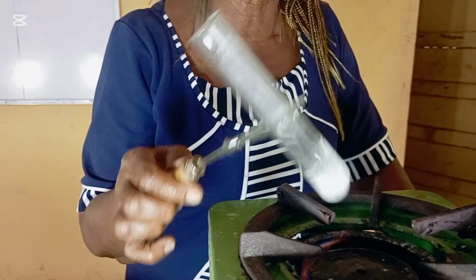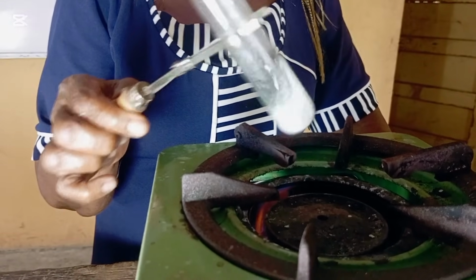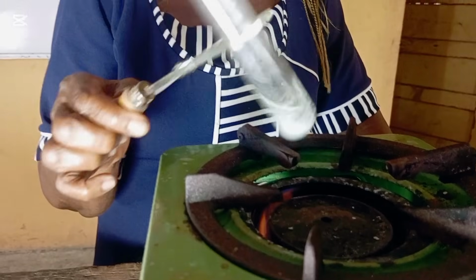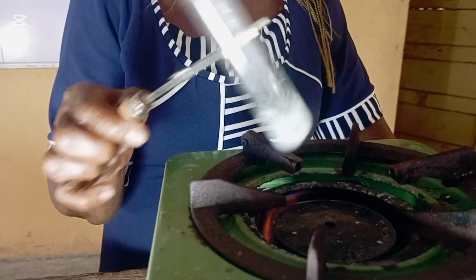And lead 2 chloride dissolves in hot water. It's an insoluble lead salt, but in hot water it dissolves, and in cold water it has to remain insoluble. So that is the test we are doing here.